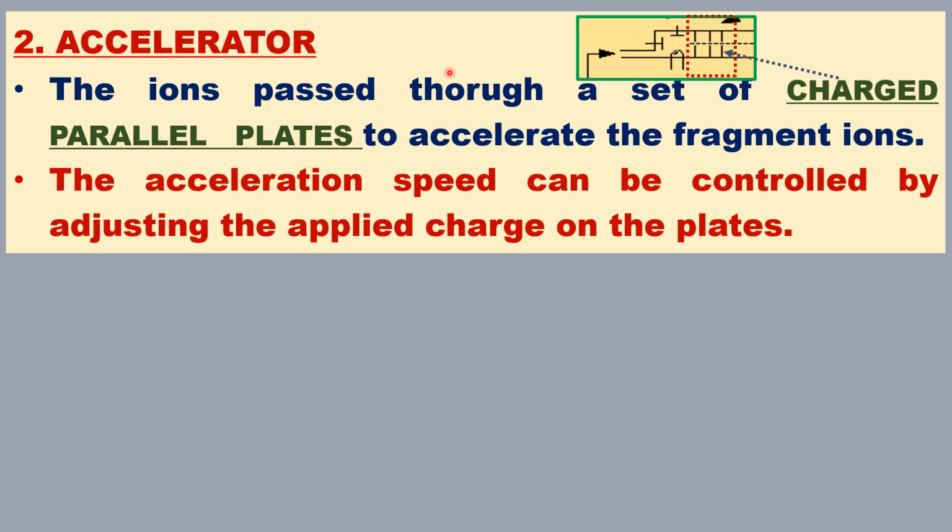The ions are passed through a set of charged parallel plates to accelerate the fragment ions. The acceleration speed can be controlled by the applied charge on the plates.